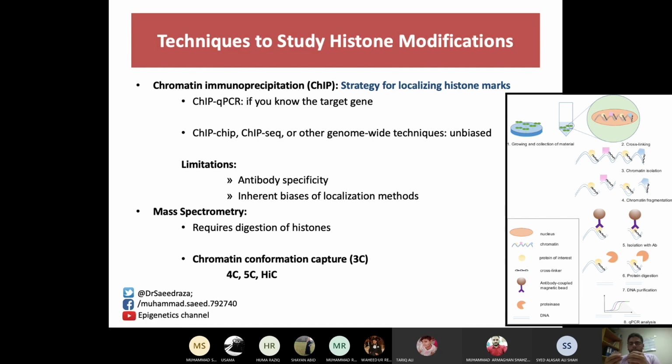So in our normal cells we have something like this, where you have an antigen and there is an antibody which could specifically bind to this antigen. By their reaction, by their association, they are no more soluble in the solvent mixture, so they could precipitate down. So this overall process is called immunoprecipitation.